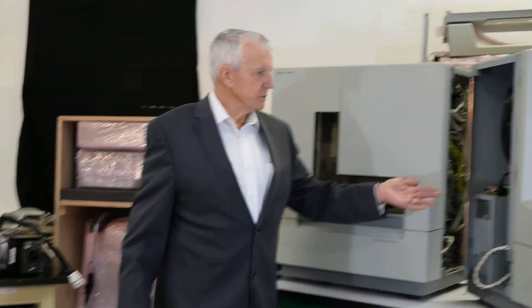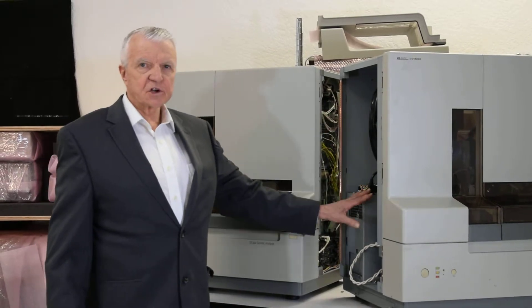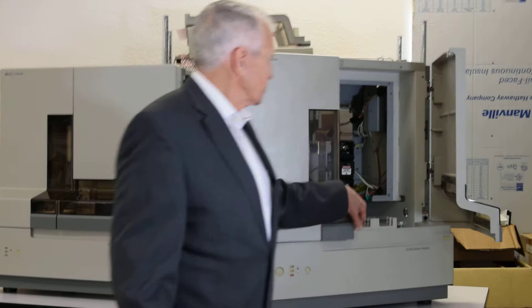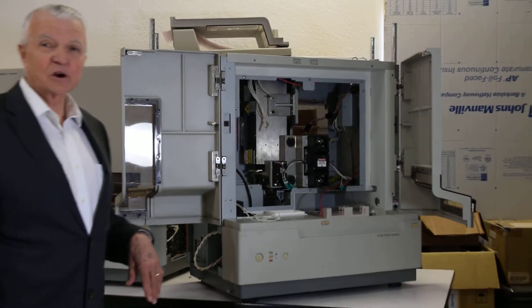Now, if you pan over here, this is the side of the instrument that the laser goes in on. And if I open these doors here, you'll see that there's a lot of things that seem to be missing — and in fact, they are missing.